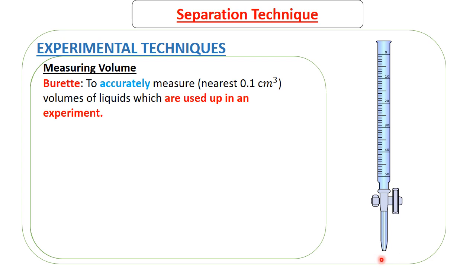So one of the reactants in the reaction can be here. So what you want maybe is to add another reactant. So what you do is you pour your reactant in here. Of course, it has to be a liquid because that's what we are studying here. So let's say you pour up to here. So the surface of one of the reactants has reached here. So the idea is you use this to make sure that you allow some of the reactant to pass and mix with whatever is down here for the reaction to happen.